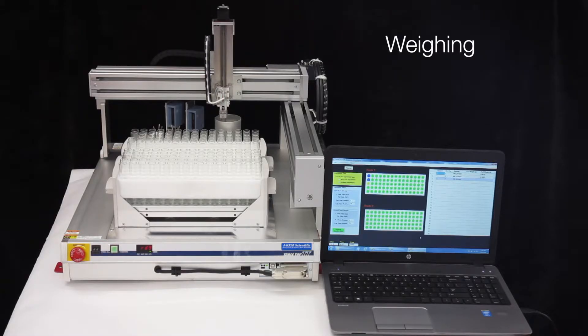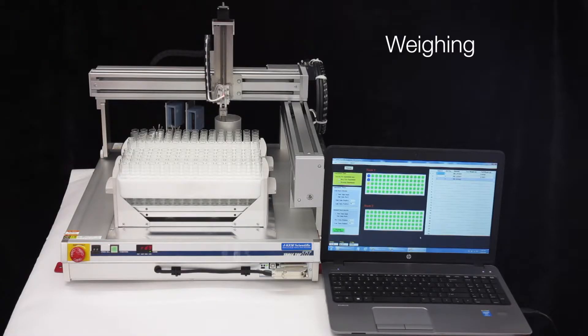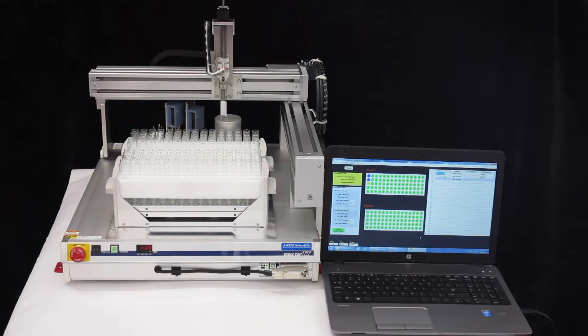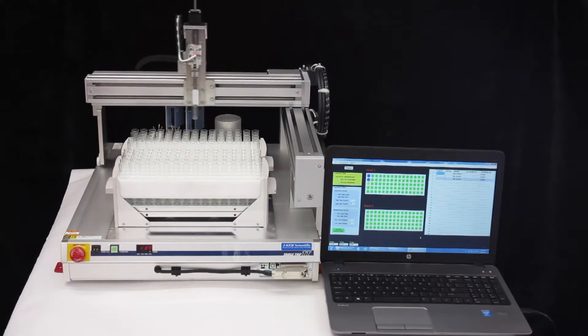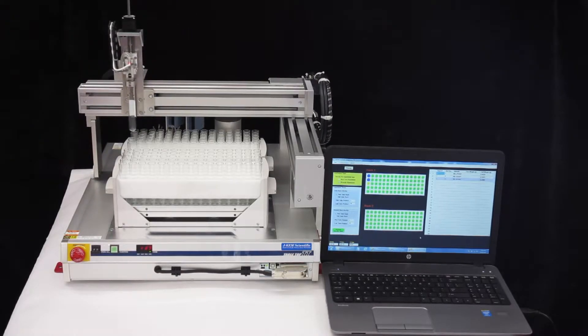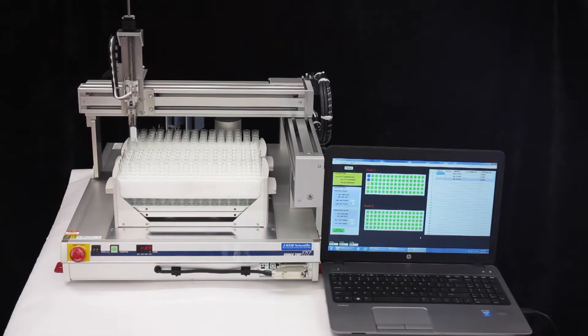In some ways, this is the perfect robot. The perfect robot should be an instrument that you can walk up to, put your racks on the deck, click the start button, and then walk away.